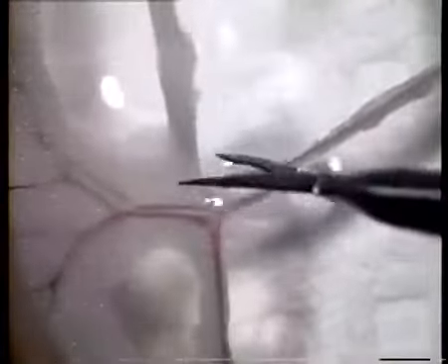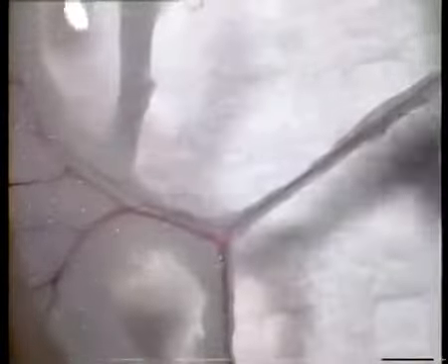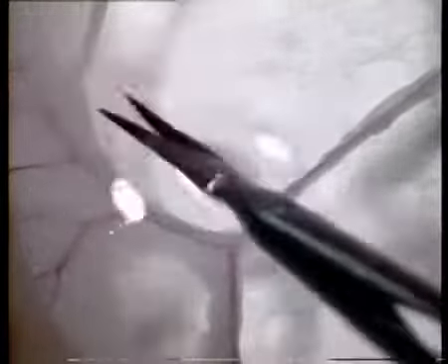The easiest technique is to hold the fat tissue with the forceps and pull, and then make the cut. For each small cut you make with the scissors, make an extra little stretch with your forceps. You can see that a lot of the fat is removed in this way.